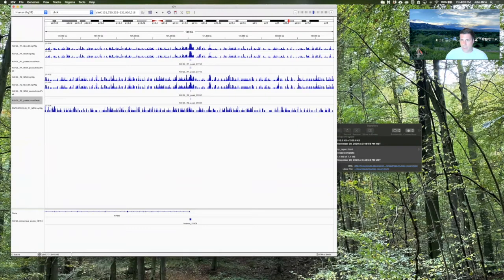I apologize, I can't make this much bigger, but I'll try and show you that the first line is running it on the old version of ChIP-seq. This is a bigWig file for this interval here with a gene we're interested in. And you can see both replicates called the exact same peak, essentially. So that's really good news, that if you run the old pipeline and the new pipeline, you get the exact same bigWig, which you'd hope the alignments would be the same, but you also get the same peaks. So the algorithm hasn't changed that much.